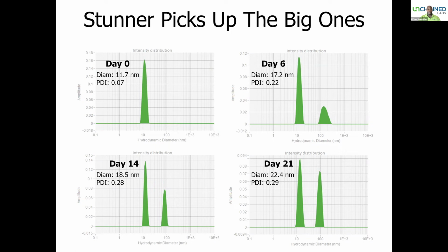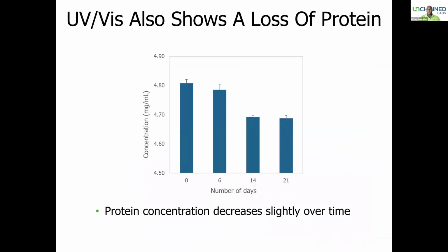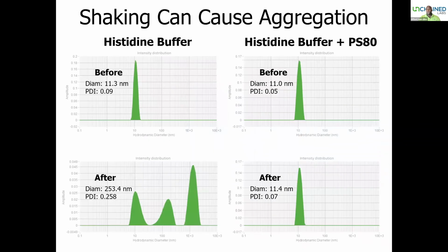And this is what the standard can do for you. In addition to that, we can look at the UV vis and see that the concentration itself over time begins to change as your protein may undergo other processes and break down or simply hydrolyze, for instance. Okay. We can also see that there are other effects that we can note.